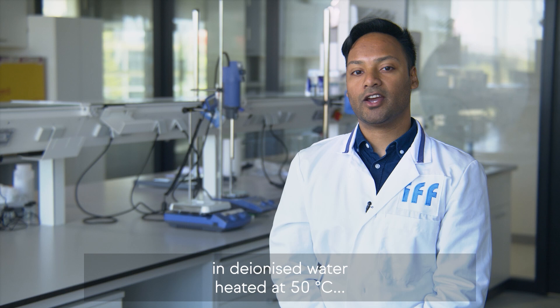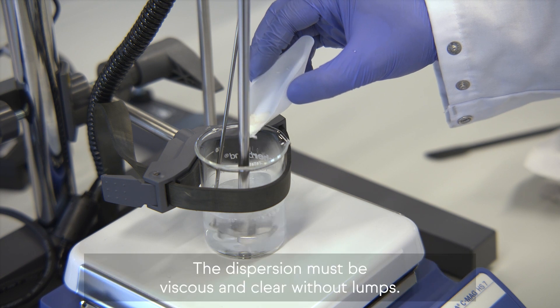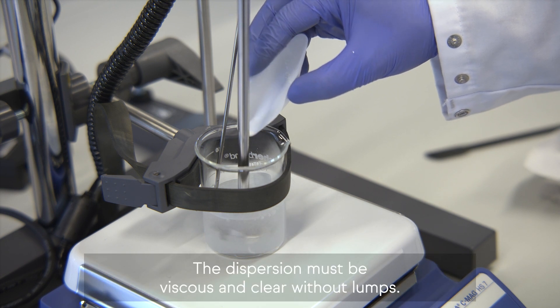Disperse hydroxyethylcellulose in deionized water heated at 50 degrees Celsius and stir with high shear until fully hydrated. The dispersion must be viscous and clear without lumps.